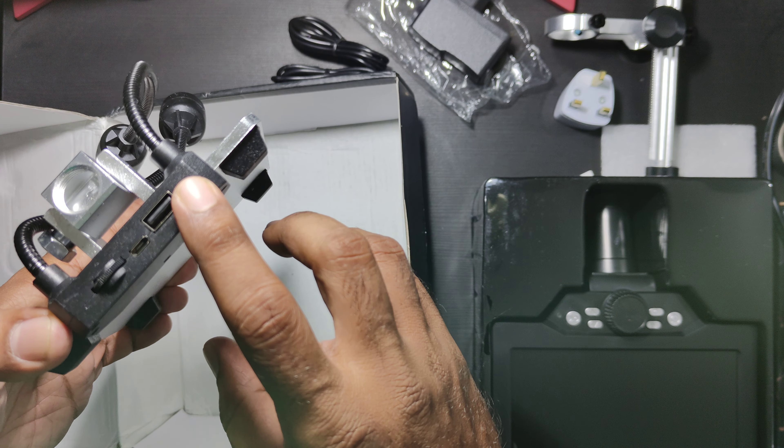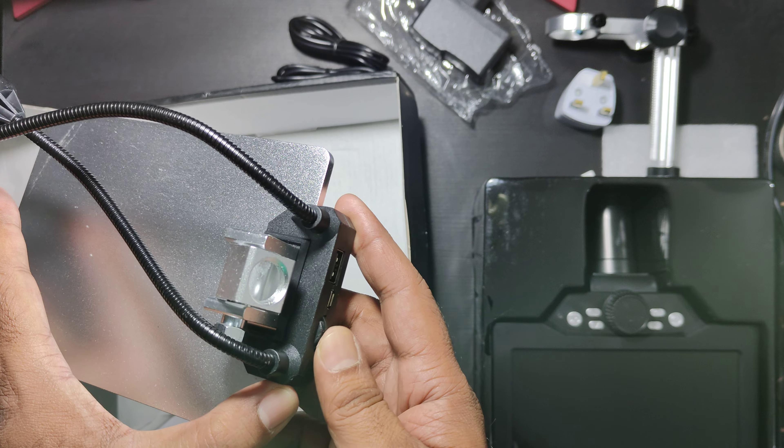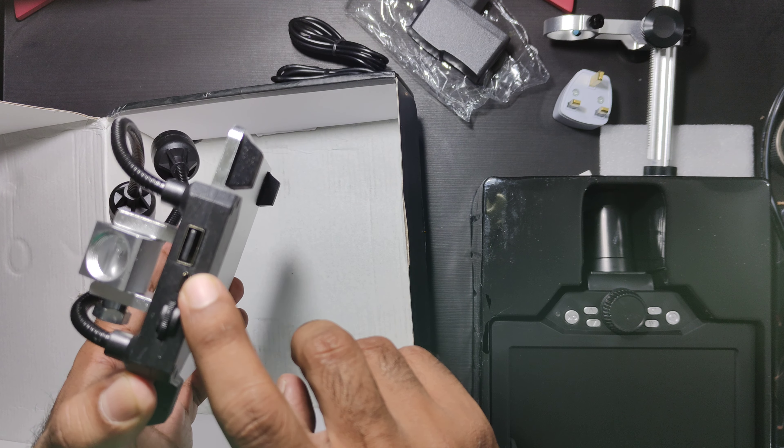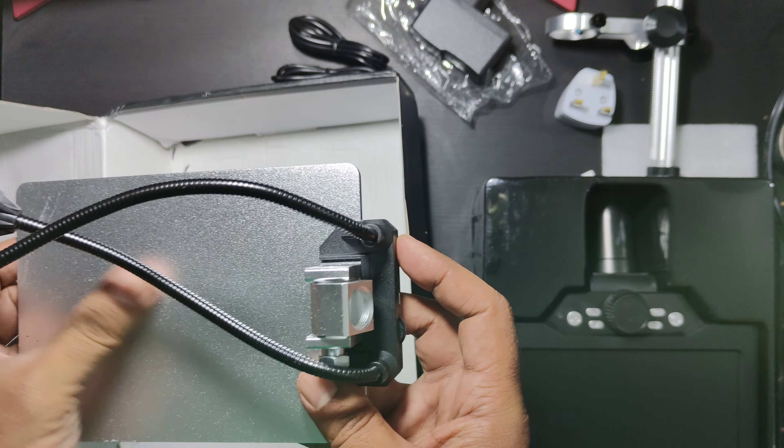Along with shipping and all the other stuff. There is a — I'm sorry, it's not Type-C, it's a micro USB cable.